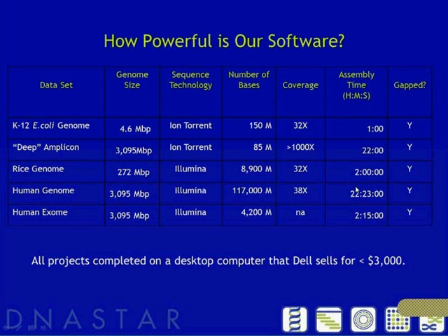So we have that assembly capability, and then we also have the analysis tools, so I can look at this genome on my laptop and do all the analysis that I need. These are some really fast reference-guided times. I should point out that oftentimes in a de novo assembly, there are iterations between doing a de novo, closing some gaps, and then using those contigs as reference sequences in confirmation assemblies. So a lot of times you alternate between reference-guided and de novo as you close those gaps. It's important to have this fast assembler as well.